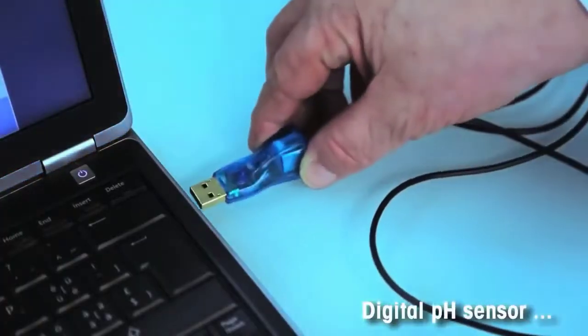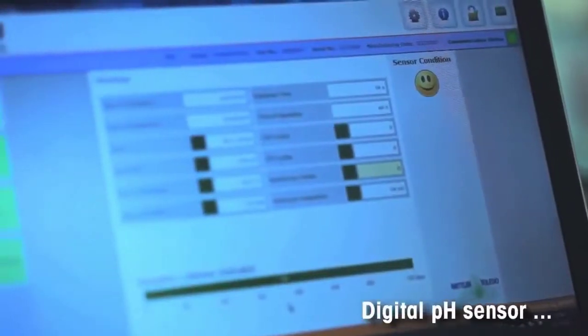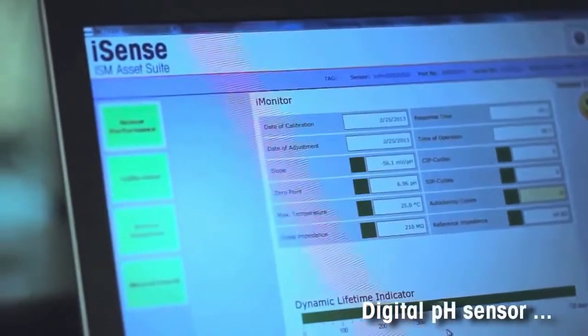At the end of the batch, connect the sensor to iSense, which displays all relevant data such as exposure to SIP cycles.